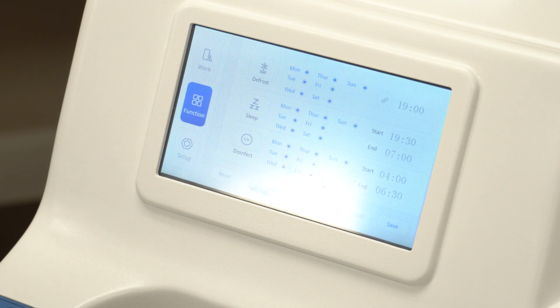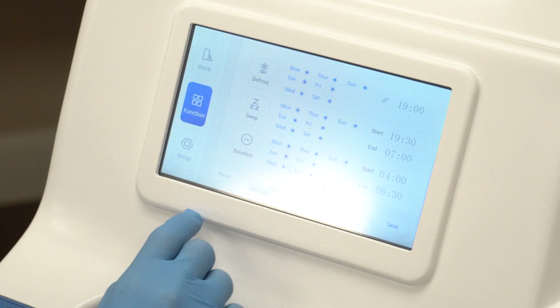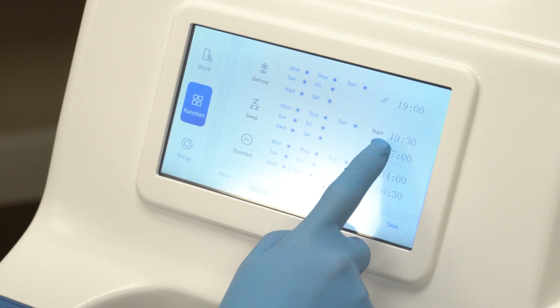Activate it by turning on the sleep icon. This mode maintains the freeze chamber temperature between -5 degrees Celsius to -15 degrees Celsius with dimmed display backlight. Automatic standby date setting. Schedule standby on a daily cycle. The cryostat will automatically activate standby when the system time matches the specified date.